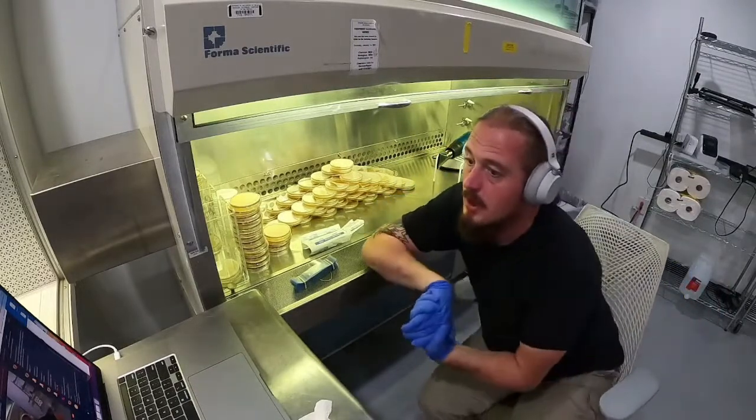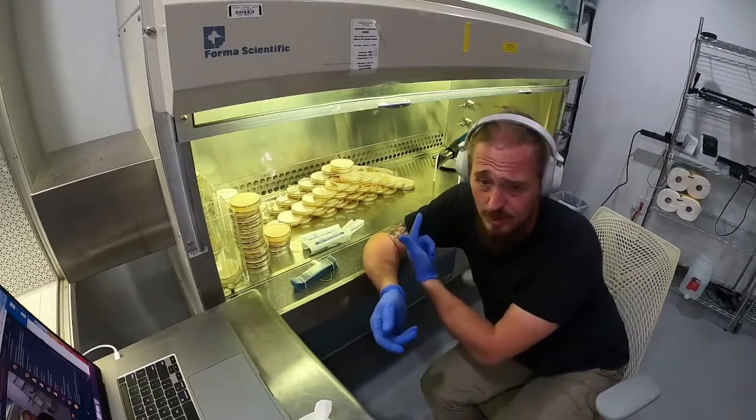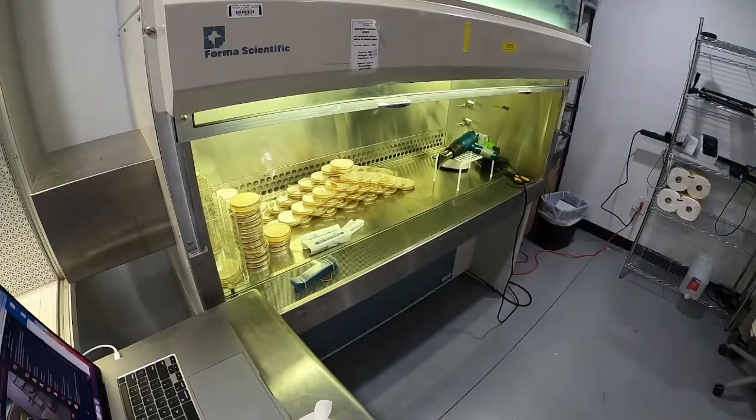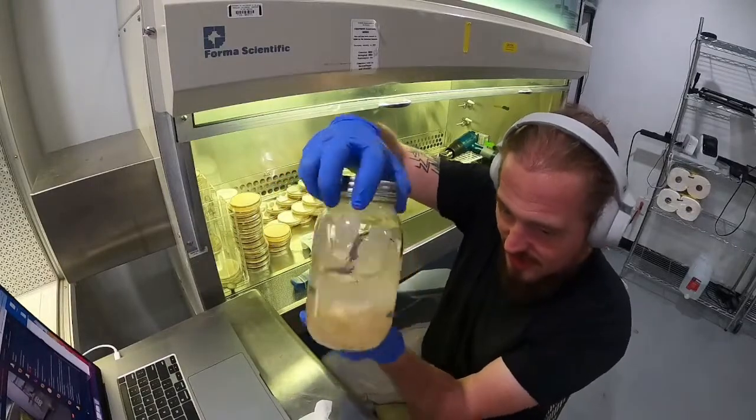Sup, Michael Jordan? So now I'm going to go back to the liquid culture versus agar culture thing, which is actually fairly advantageous given I have to pull a couple of syringes. But first, I have to go get a jar. Blue, maitake, chestnut. No. I need something interesting. I need something with oomph and circumstance. Ooh, shiitake. Oh, heck yeah. Somebody's getting this beautiful shiitake culture. Look at that.